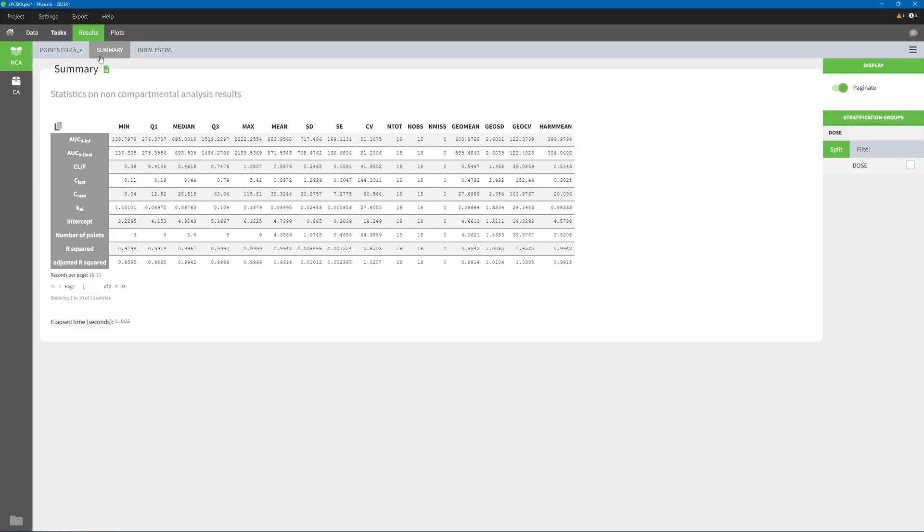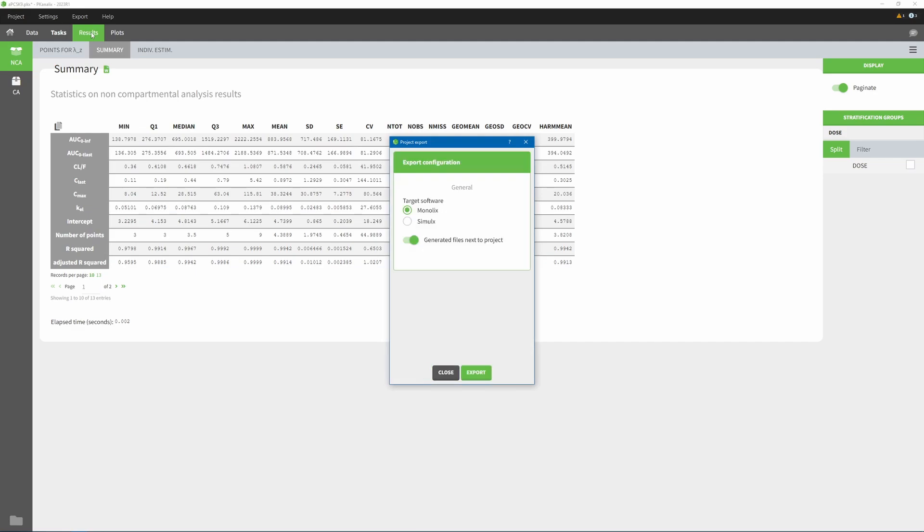Furthermore, the latest version of PK Analytics is even more connected than before with other applications of the Monolix suite. In particular, you can now export your PK Analytics CA runs to Simulix to simulate new scenarios for the individuals present in the dataset.